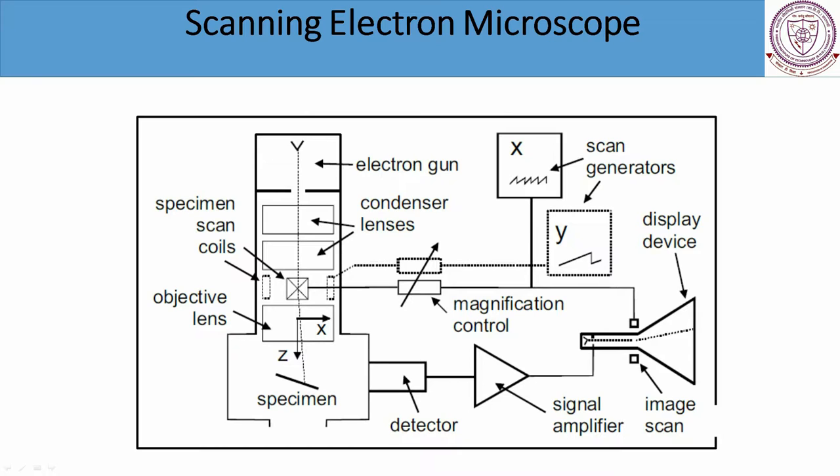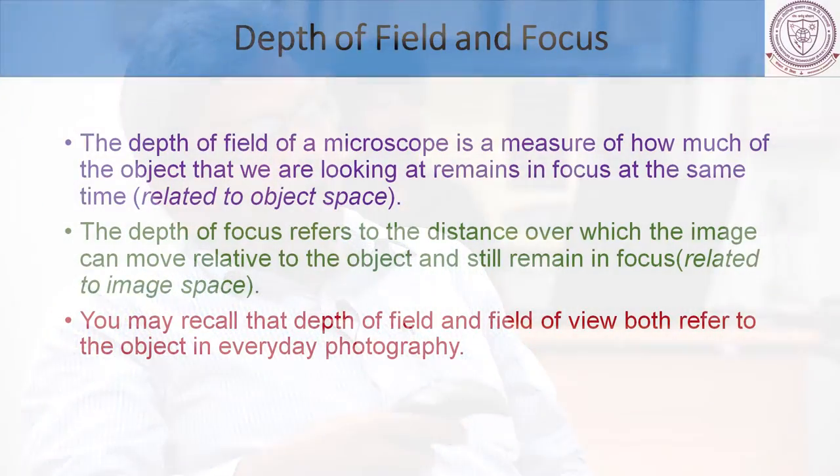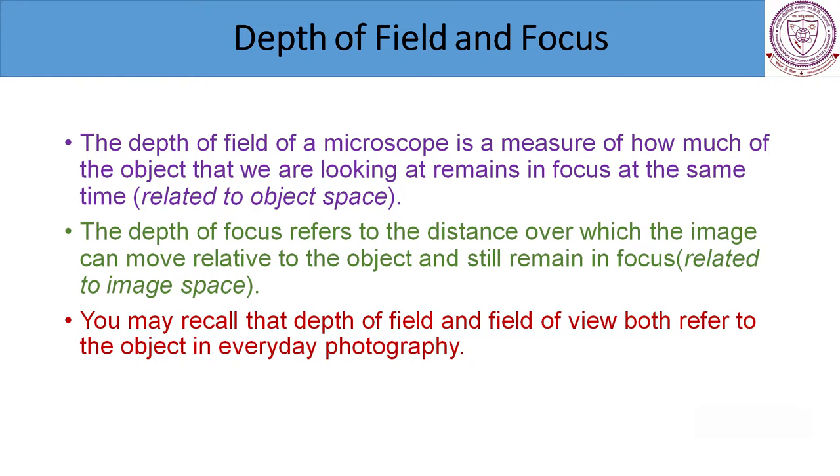Resolution as well as magnification. But the resolution is going to be the most crucial thing. In the next slide, the most important advantage of both the variants of microscope that I'm going to talk to you about relates to depth of field and depth of focus.